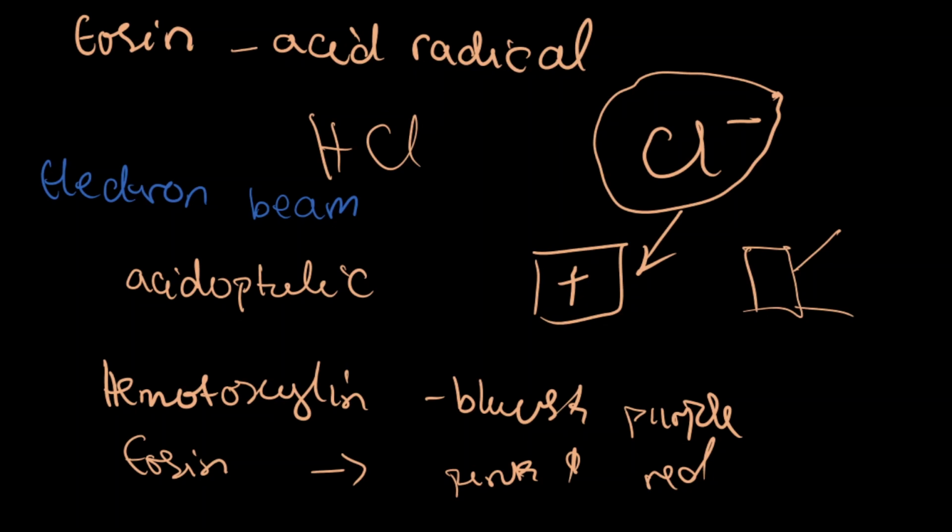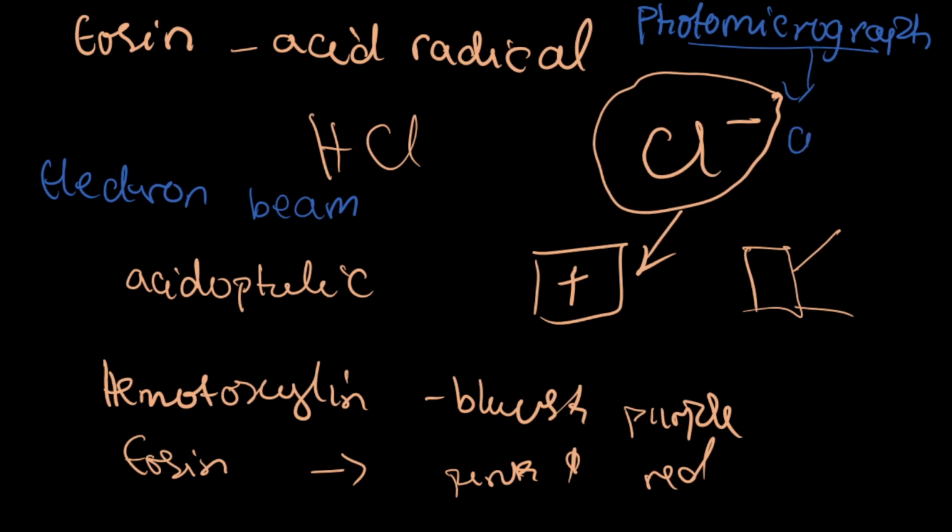So what do we expect? This simply means that the photomicrographs of a light microscope give us colored images.